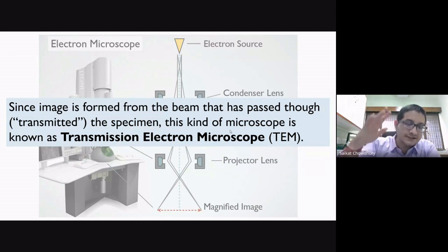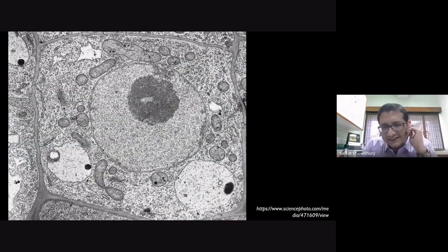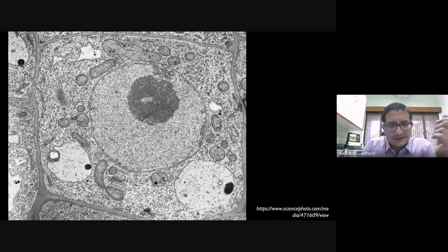This not only doesn't give the surface feature, but actually gives all the information that is present inside the object that we want to view. Now, many of you have seen these in your textbook, a general structure of a cell. These come from classic cell biology textbooks.